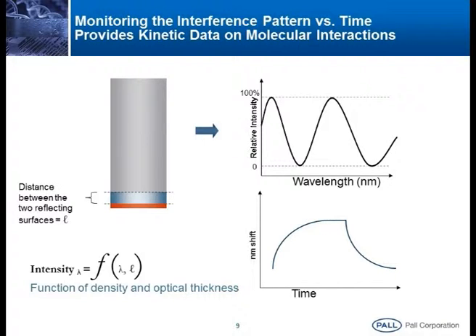See, this is what we call the association phase. As the molecule starts binding to the binding partner, we can see the curve rises. This we call association. Once we bring the same sensor back to the buffer, the bound molecule on the receptor gets washed off. Now, we can see this phase, which we call the dissociation phase. So, dissociation divided by association we call the affinity.